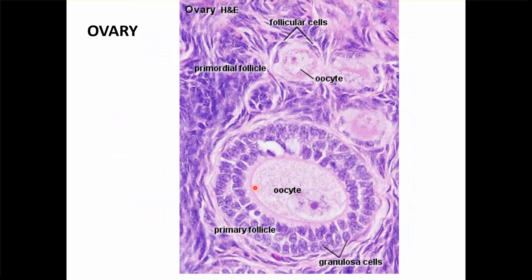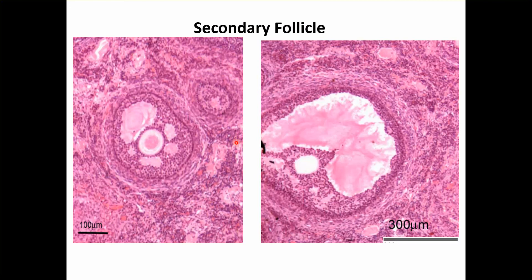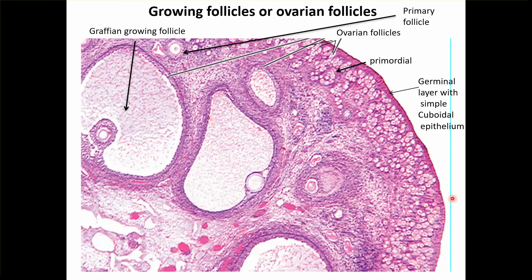Now coming to the female reproductive organs — the ovary. In the ovary you can see the primary follicle with the oocyte and the granulosa cells. The small ones are the primordial follicles. Then, if you see cavities developing within, that is the secondary follicle. This slide shows follicles at different stages.